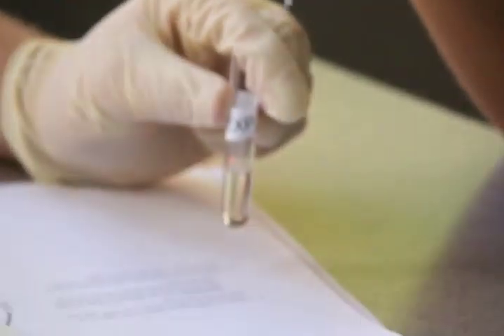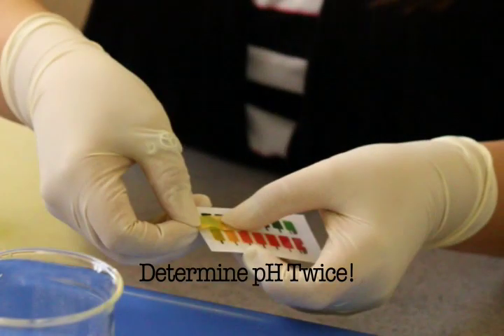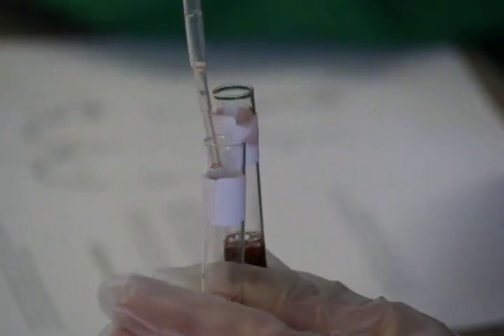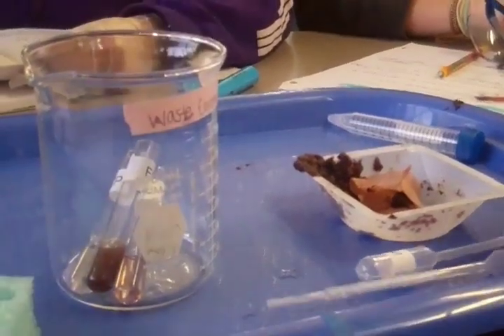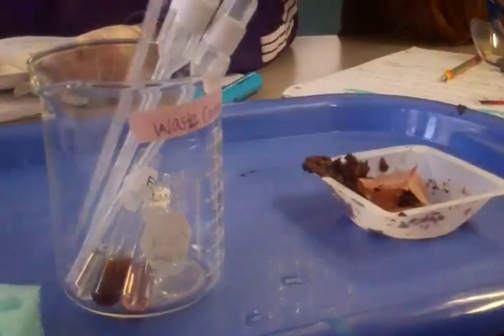Next, transfer everything from your acid tube into your EXP tube. Record your pH once again. Make sure to remember that you need to record the pH twice, once before you add the acid and once after. Next, add 0.1 milliliters of your tyrosinase enzyme to the EXP tube. Start timing immediately and use your colorimetric chart to record the color at every time interval. Dispose of your materials safely, and you're done. Through this experiment, you were able to see the effects of pH on the enzyme.